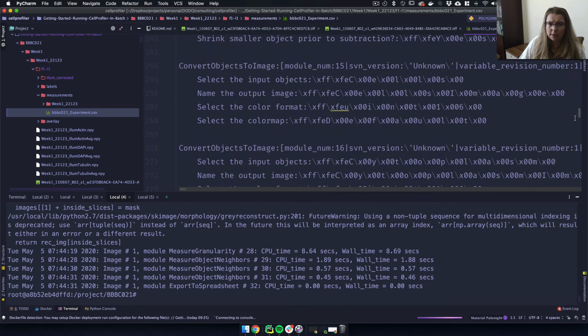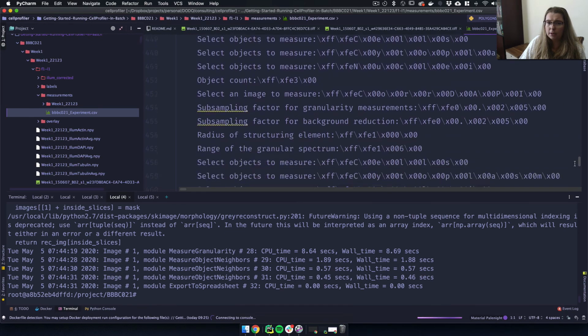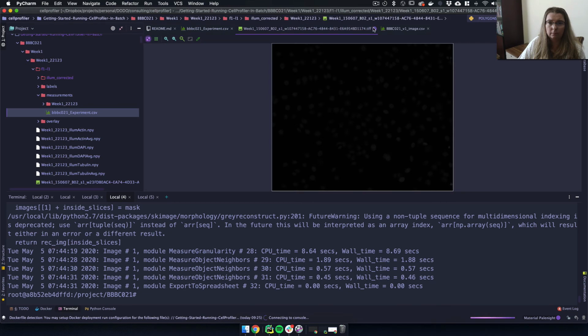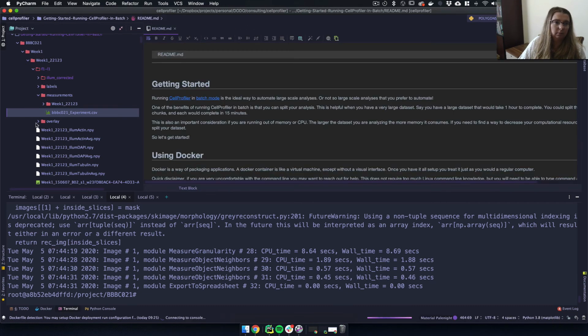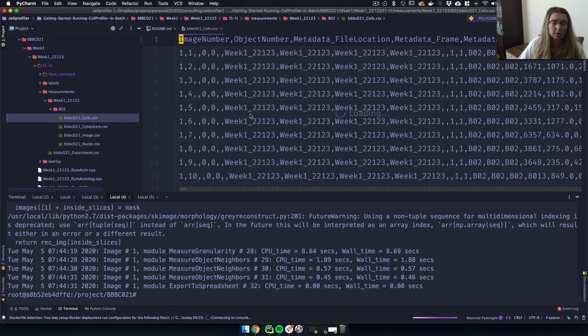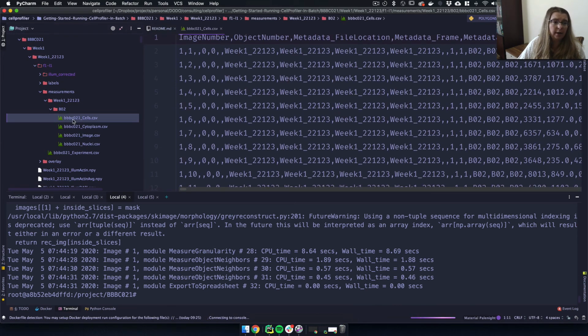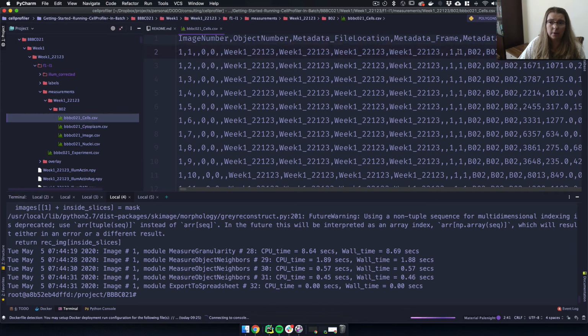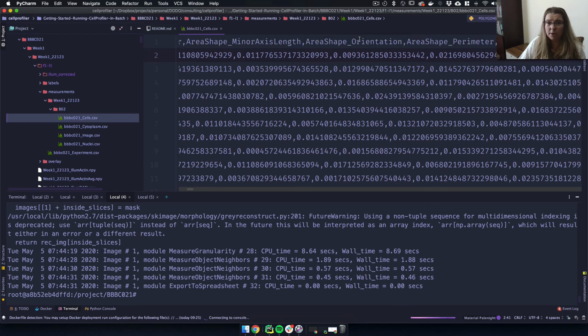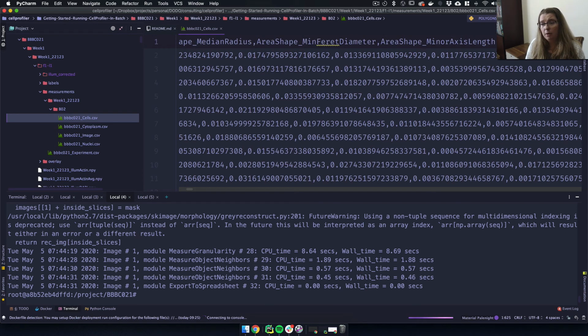So you can actually see this is a very verbose version of our initial analysis input file that gets output, I would imagine for record keeping. Really, I'm not too sure. So this whole measurements file here would get clobbered, but then you can see we have the cells, and each one of our images here, and then you have a whole bunch of measurements that I don't fully understand.